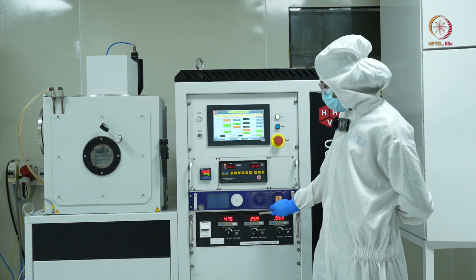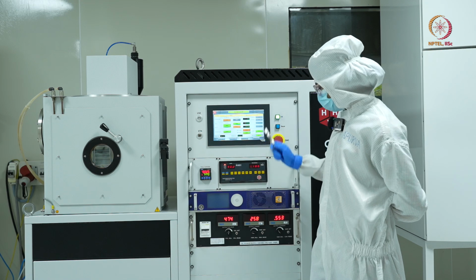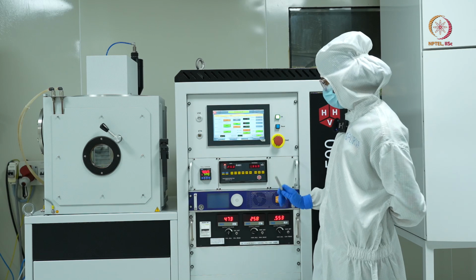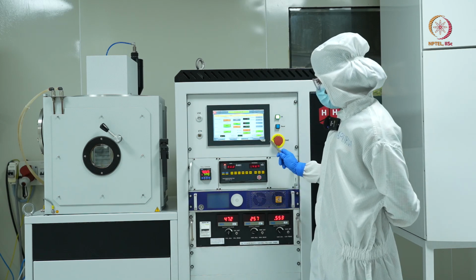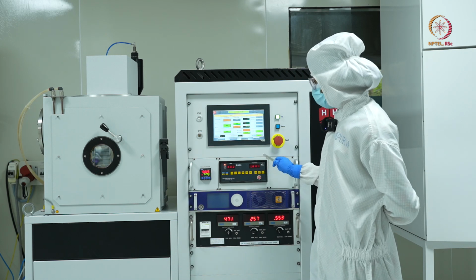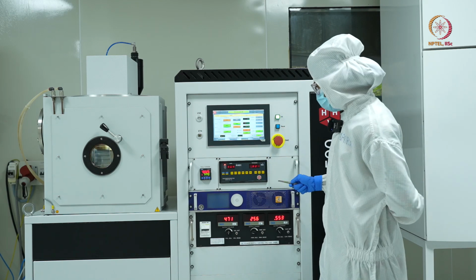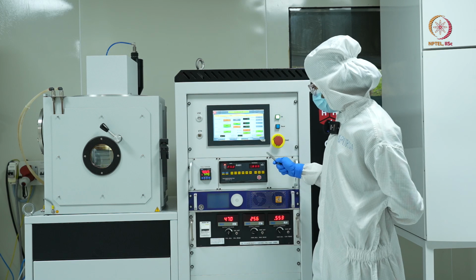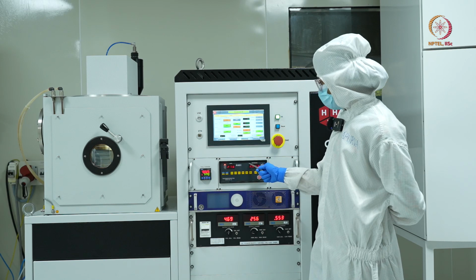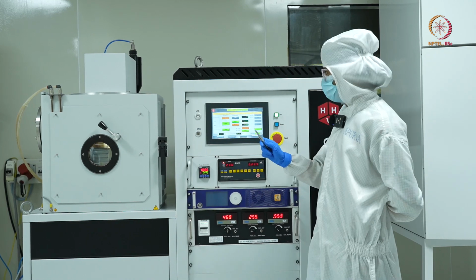To increase more power, we can increase the argon flow if required, but I feel this is sufficient power for the deposition to happen. I will deposit for around 4 to 5 minutes, depending upon how much thickness I want. Here the deposition rate is really high, so my desired thickness has been reached.